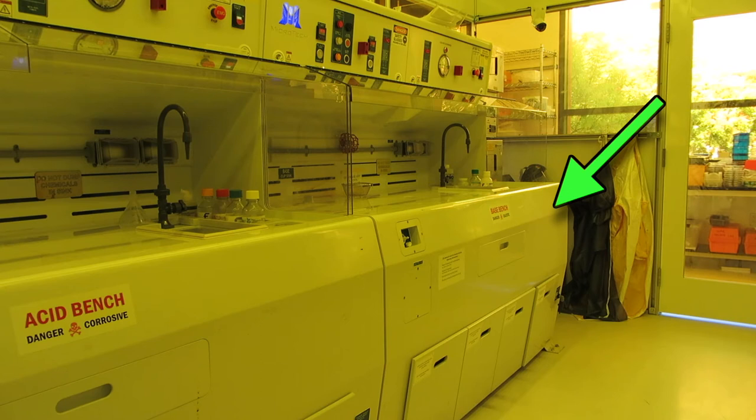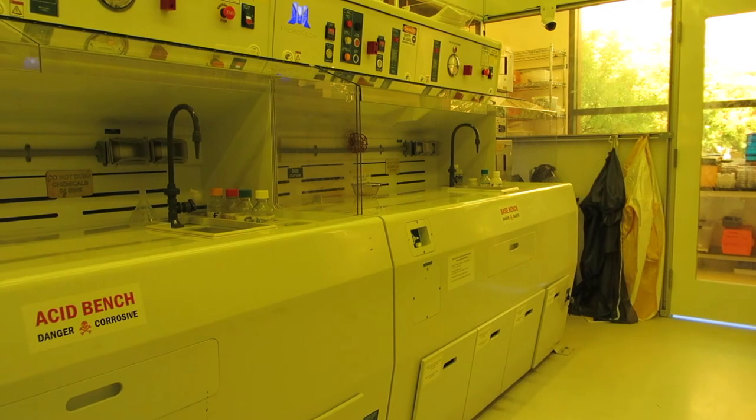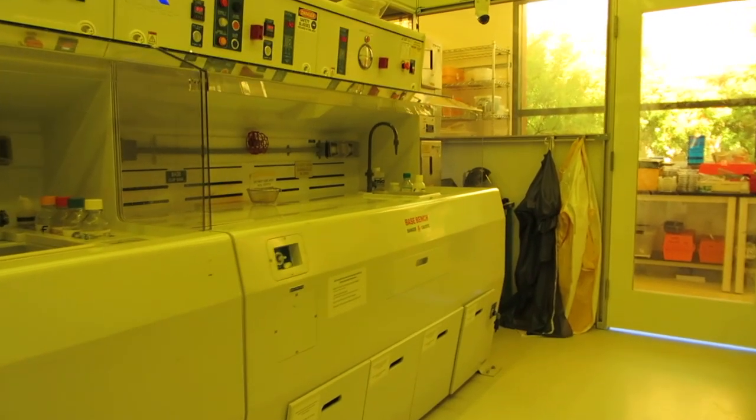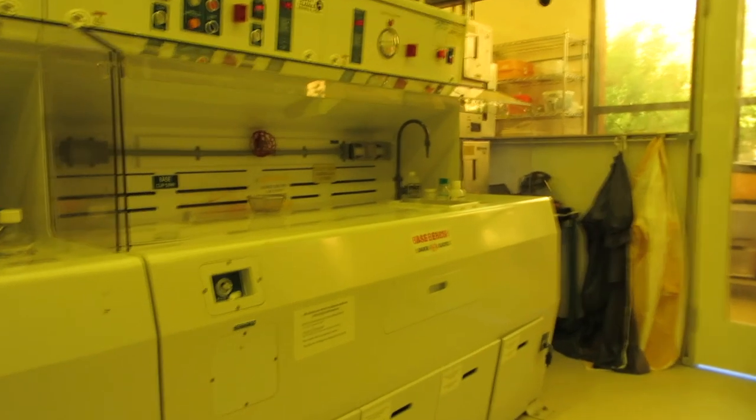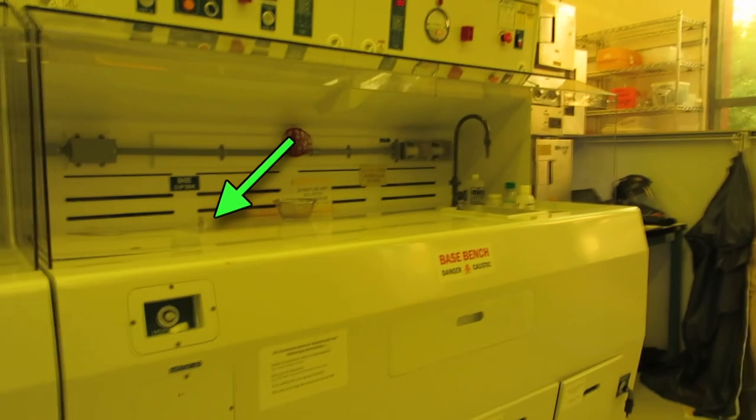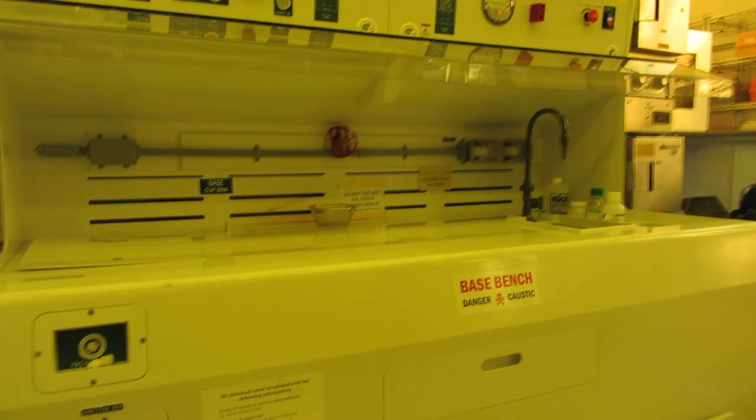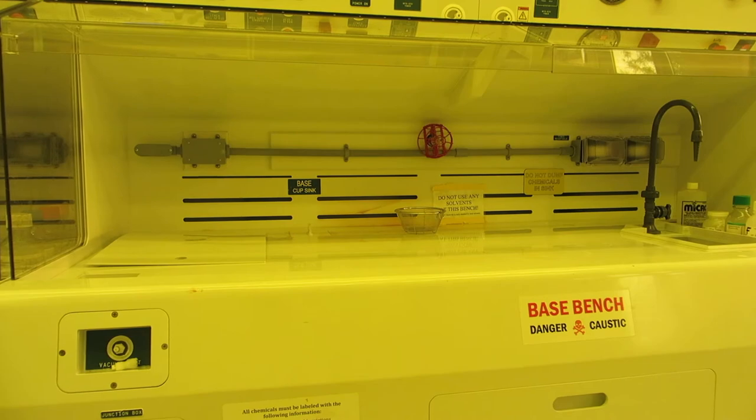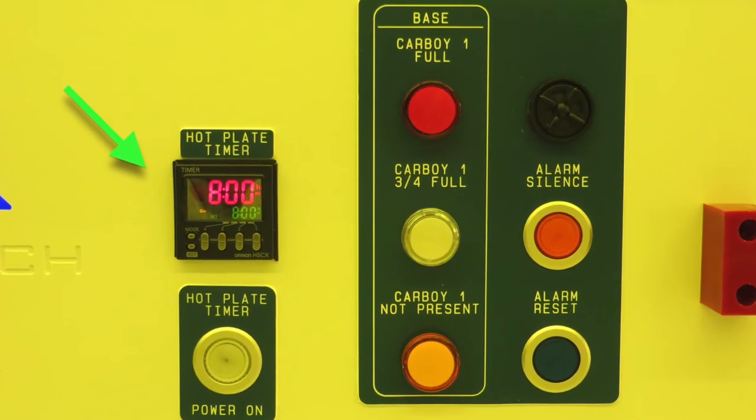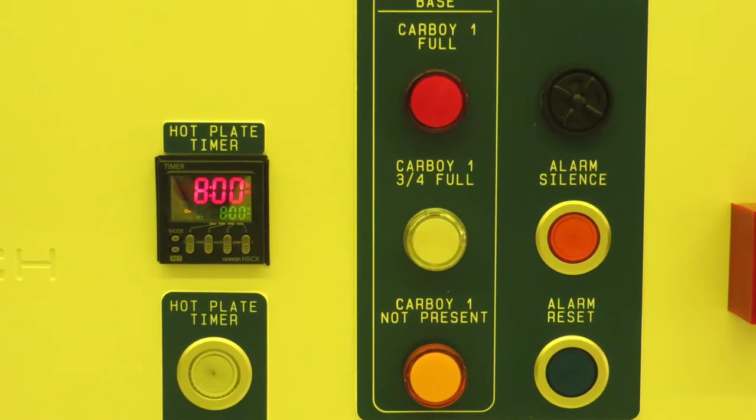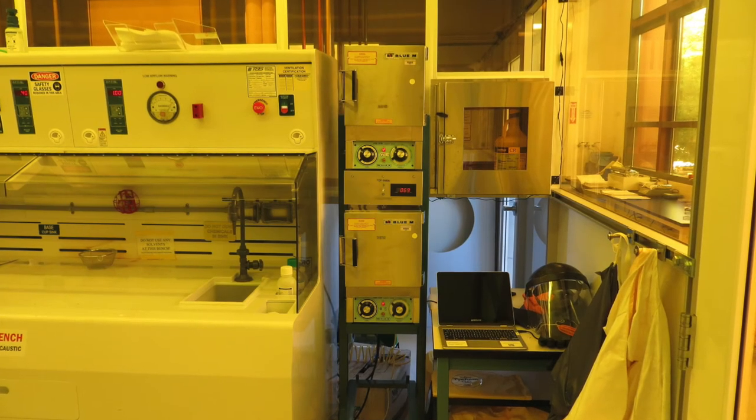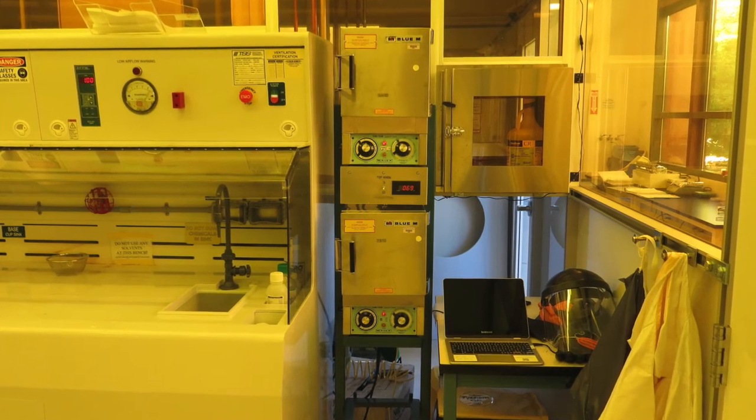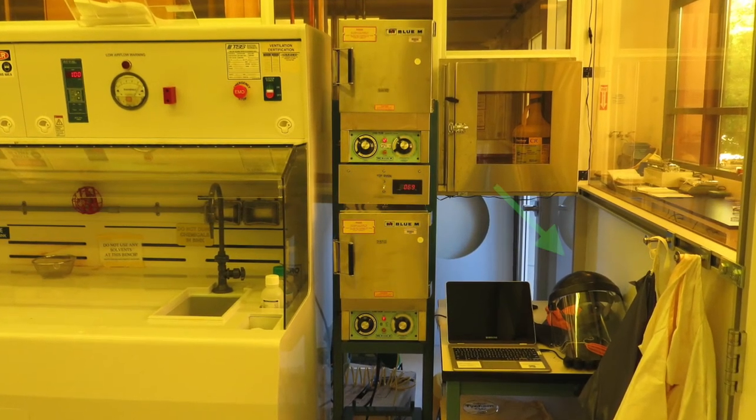The base bench has a layout similar to the acid bench. This is where you will be doing all water-based developing as well as working with alkaline etchants such as sodium hydroxide, potassium hydroxide, or ammonium hydroxide. All base waste goes into the base waste cup sink at the rear of the bench. Never work with any solvents at either the base or acid benches because the solvents will dissolve the material that the bench is made from. The hot plate timer for the base bench is set at 8 hours. This is just so that it'll turn off automatically if you forget to turn it off at night or something. To the right of the base bench there's a couple of Blue-M convection ovens and there's a pass-through for shuttling chemicals from the service chase to the yellow room. Also over here is where we store full face shields and chemical aprons.